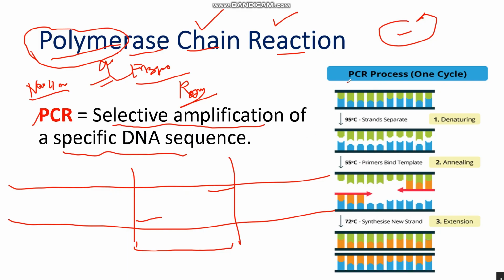So what is the PCR process? In one cycle, first of all we denature our DNA. This is the double stranded DNA, and first we make it single stranded. Then annealing. At the annealing temperature, which is what we optimize in primer or PCR optimization, we check where the best annealing occurs.